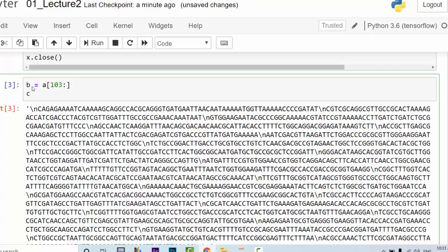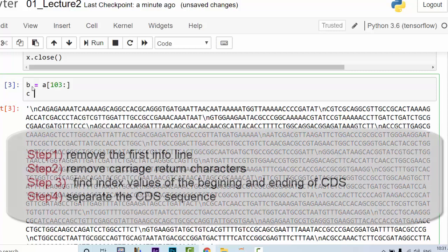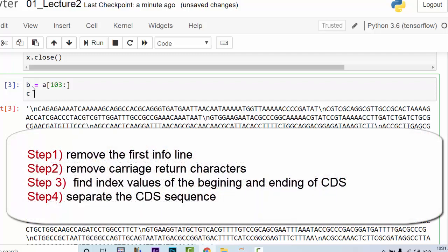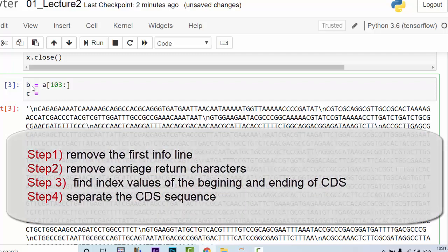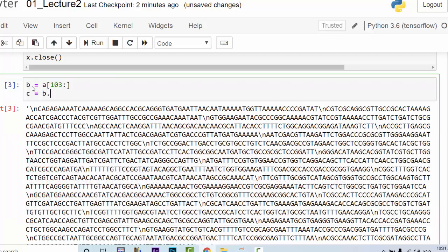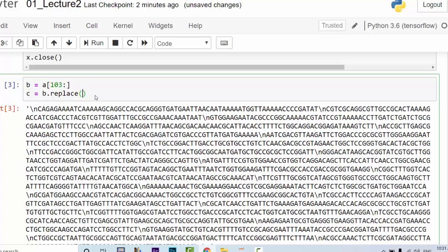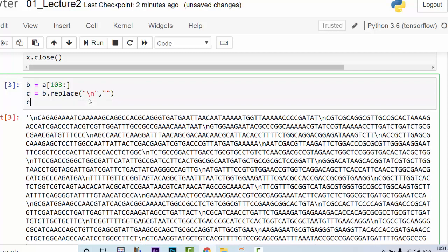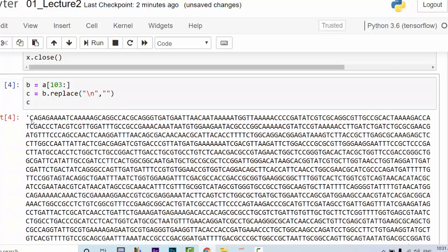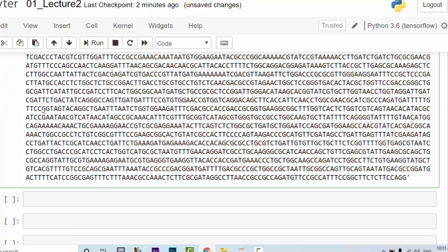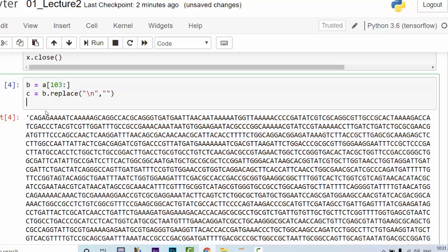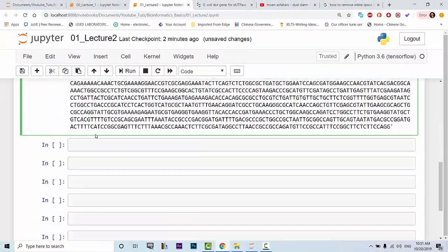Now we declare another variable called c. Well, I'm trying to do it incrementally so that you understand each step the easy way. c is equal to b dot replace. So we replace the return characters with empty strings. So this is the first argument and you just write something like this: two quotations without any space in it. And now let's see what c contains. So see, there is no return character left.